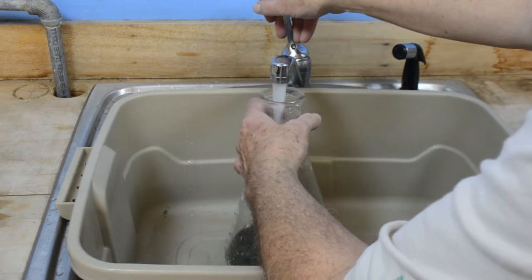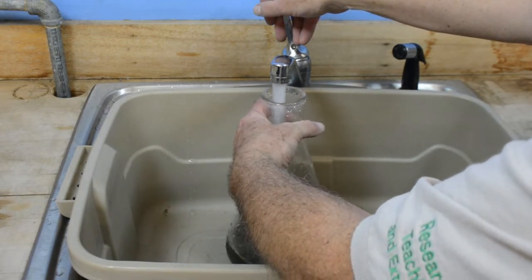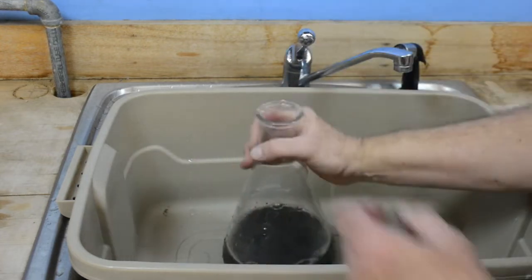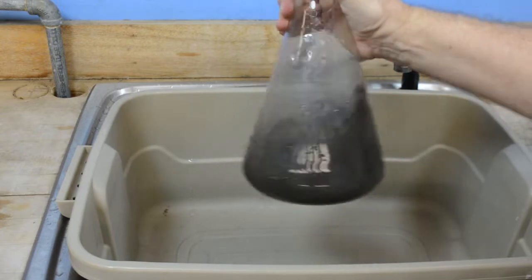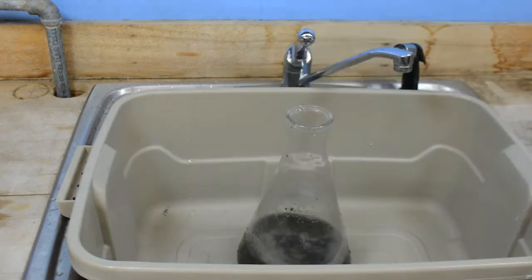I'm going to put about a gallon of water — enough water to be able to mix the entire volume of soil. I swirl it to make sure that everything is suspended. There is some organic matter in there, and much of it is floating. Then I'll let it settle for about 60 seconds, which will give time for the sand to settle out of suspension.